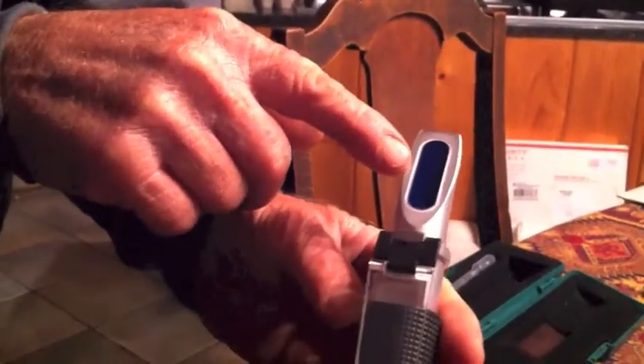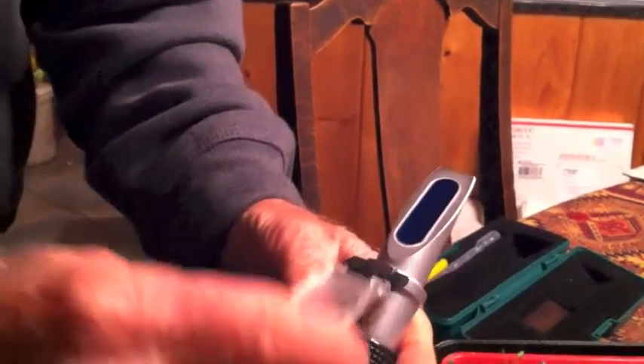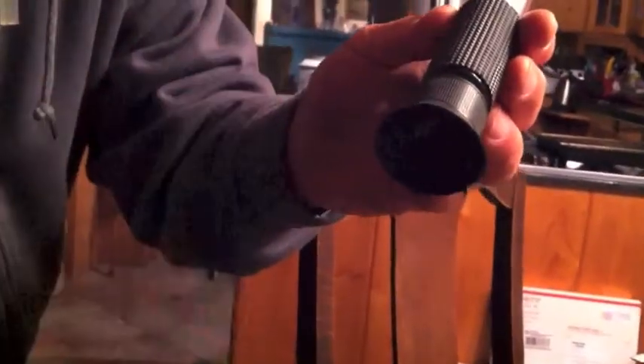You put the juice of whatever you're testing onto this little piece right here, put the cover over it, look through the lens, and the line will rise up and show you what number it is.